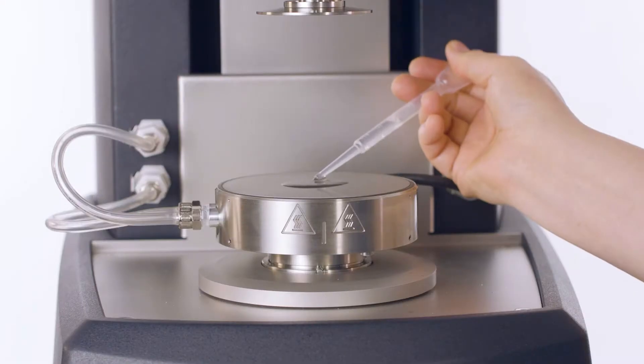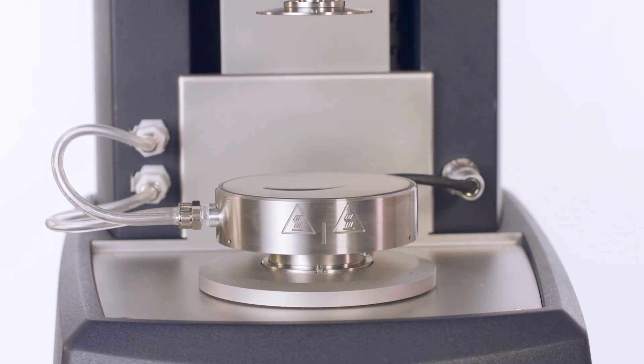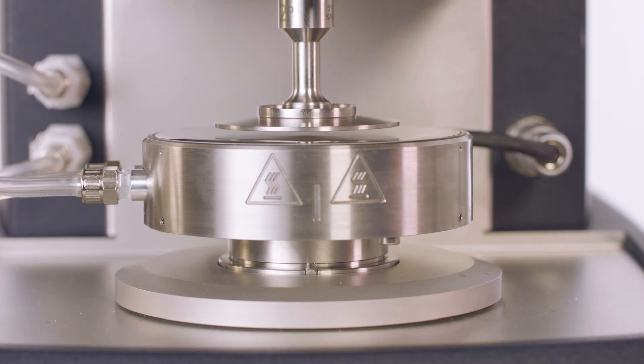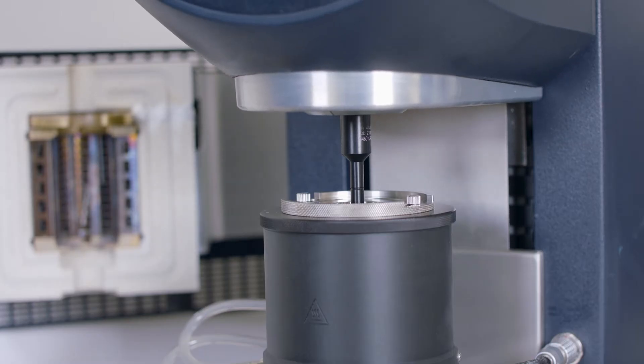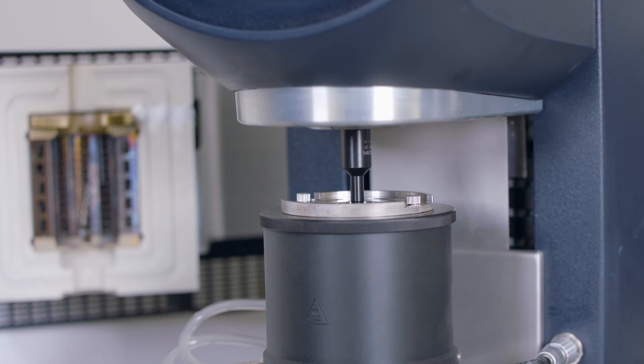In other geometries such as parallel plates or cone and plate, the sample may flow out of the gap or it can be subject to edge fracture at sufficiently high shear rates. In the concentric cylinder, the sample is secured within the container volume, allowing for both the characterization of low viscosity fluids as well as testing at high shear rates.